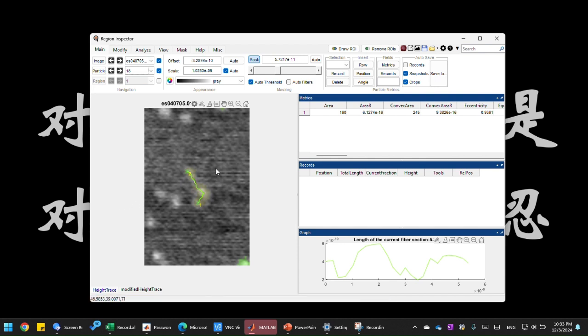And let's see this more closely here. You see, this is essentially the same protein as the one that we just saw. Only in this case, the arm length is asymmetric, right? So the arm here from the middle to the bottom domain is shorter than the arm from the top domain to the middle domain, right? So this is an asymmetrical length of its arms.